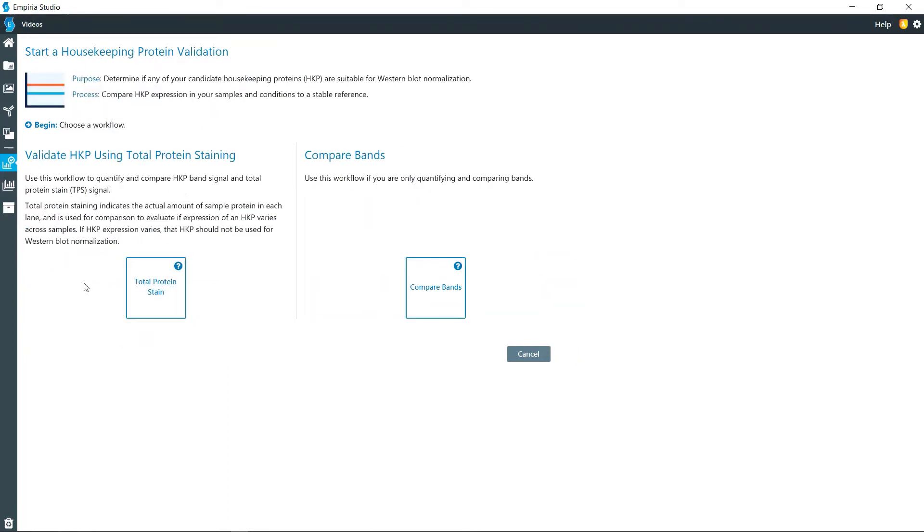You can either do this using the total protein stain such as the Revert 700 or 520 if you have the Odyssey M, or you can just compare bands within a one or two color image. The images I'm going to be using right now are for compare bands.